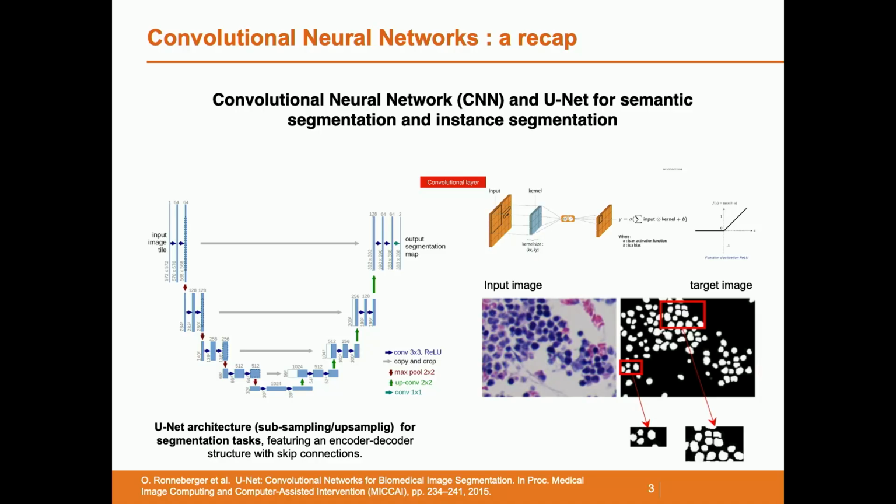The target images are segmented images in general, so you have binary masks to train the model. So you need a lot of data to train the model parameters. The model parameters are the neural network parameters plus the weights of the different filters that I just mentioned before.